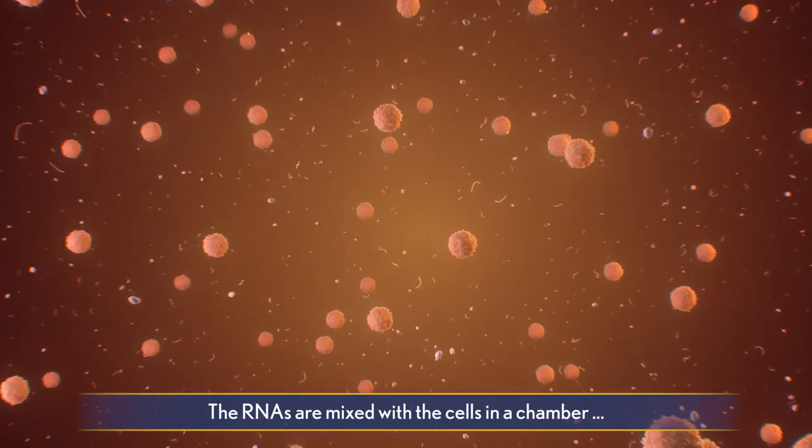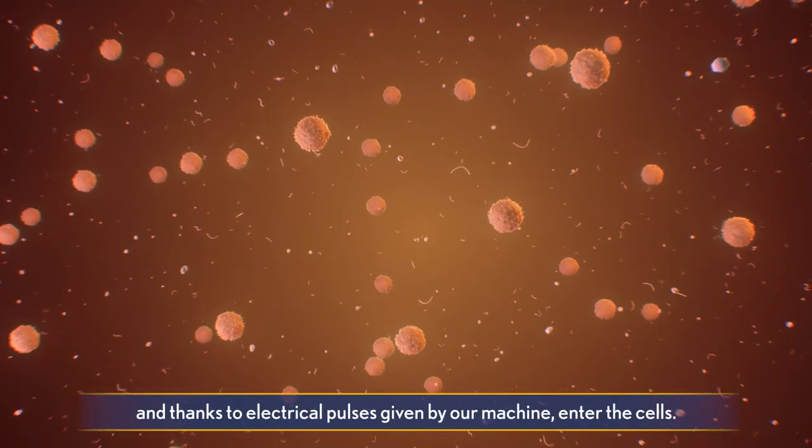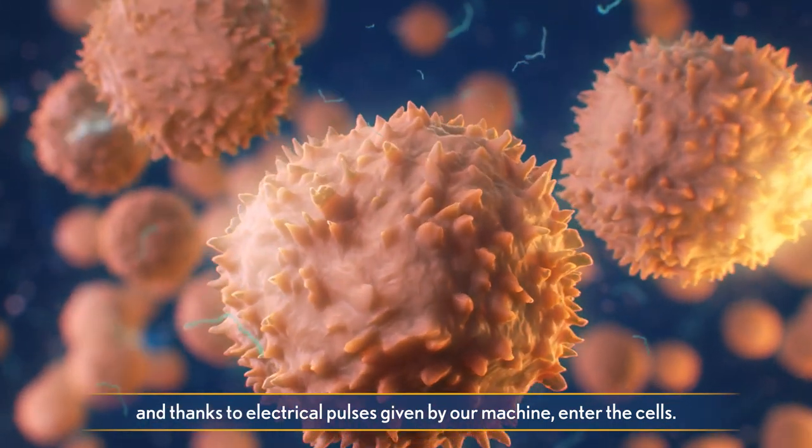The RNAs are mixed with the cells in the chamber, and thanks to electrical pulses given by our machine, enter the cells.